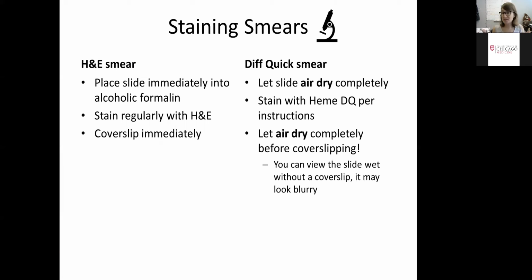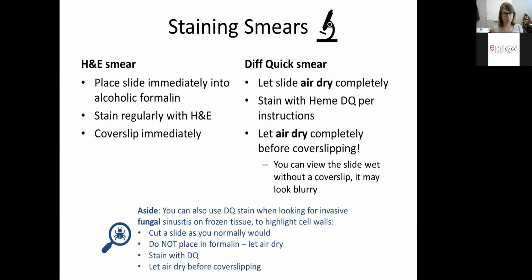So you can view the Diff Quick slide wet without a cover slip. It just may look a little bit blurry, but if you want it to dry faster, you can put it in the fume hood to get that evaporation happening. But really, please don't cover slip until it's completely dry. Okay. All right.